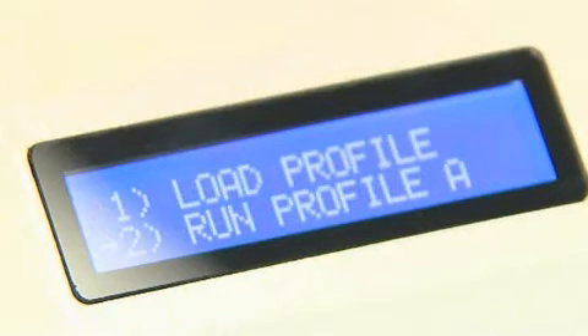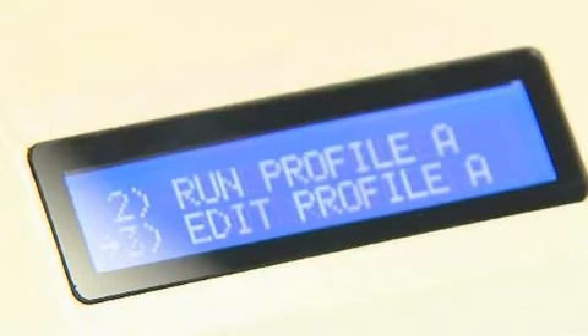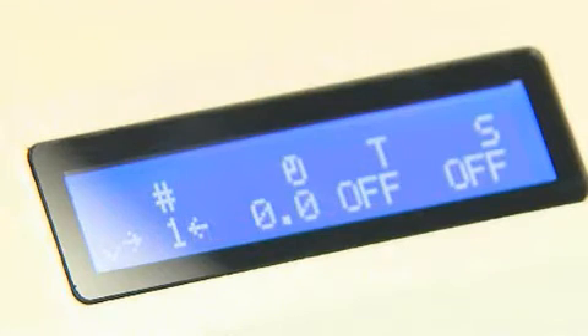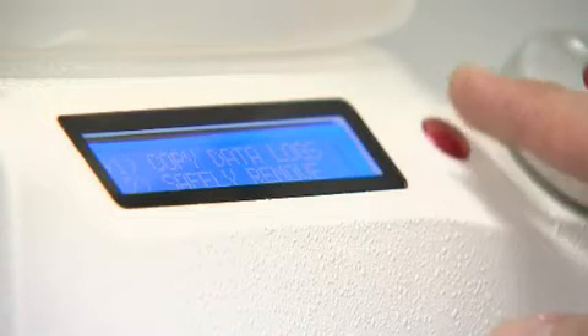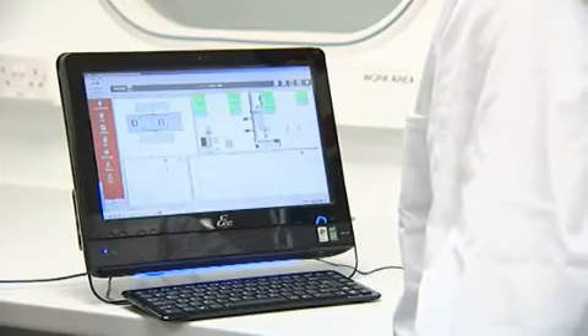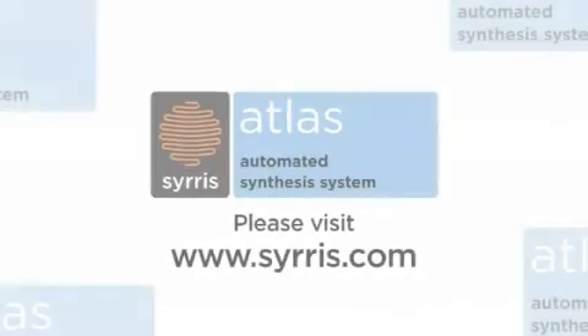Atlas also allows heating, cooling, stirring and reagent addition profiles to be created and run automatically from the Atlas base, with full data logging. Control systems in parallel using the Atlas software. Atlas simply does it all.